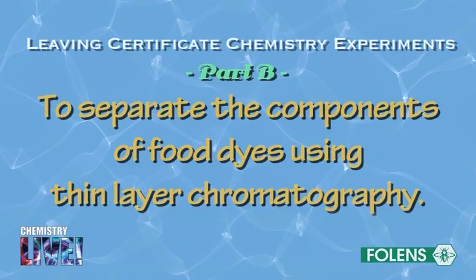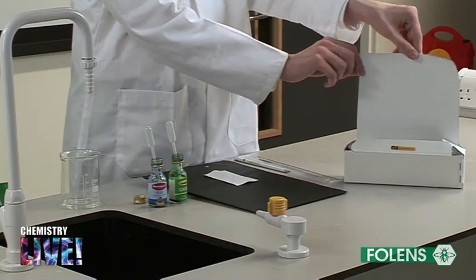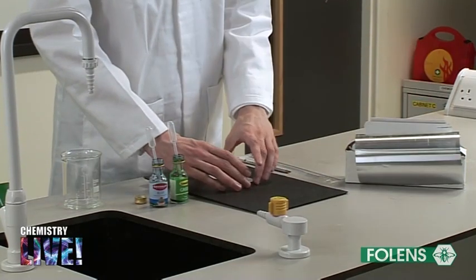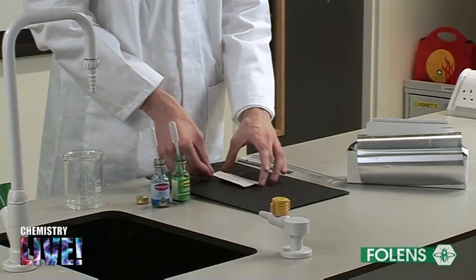Part B: to separate the components of food dyes using thin layer chromatography. A strip of TLC plate was cut from a roll. Using a pencil, draw a faint line about one centimeter from the bottom of the plate.